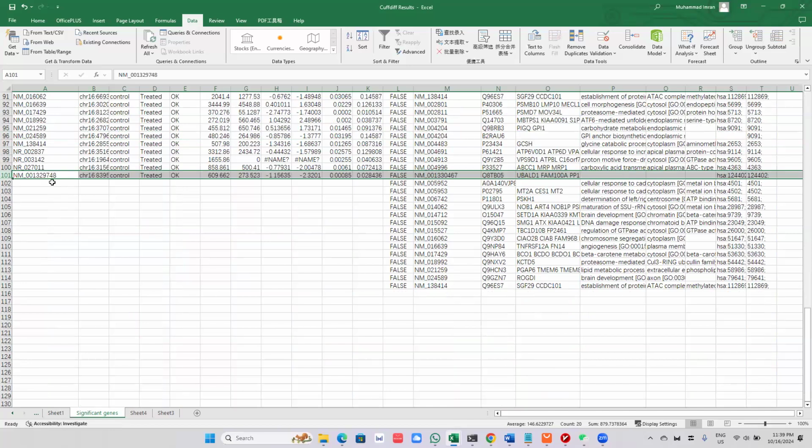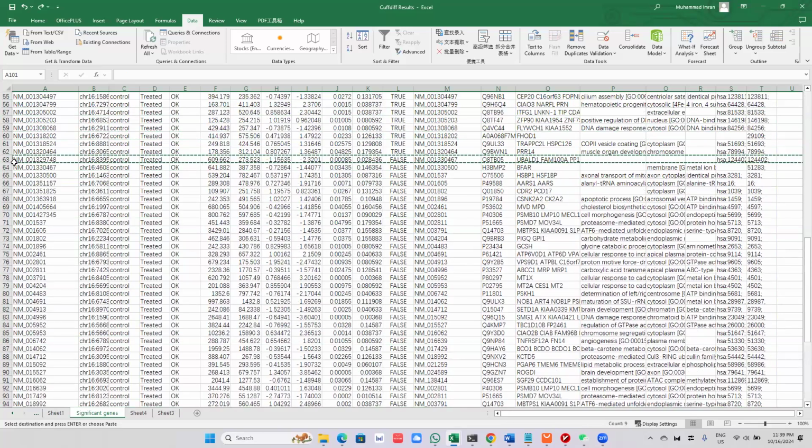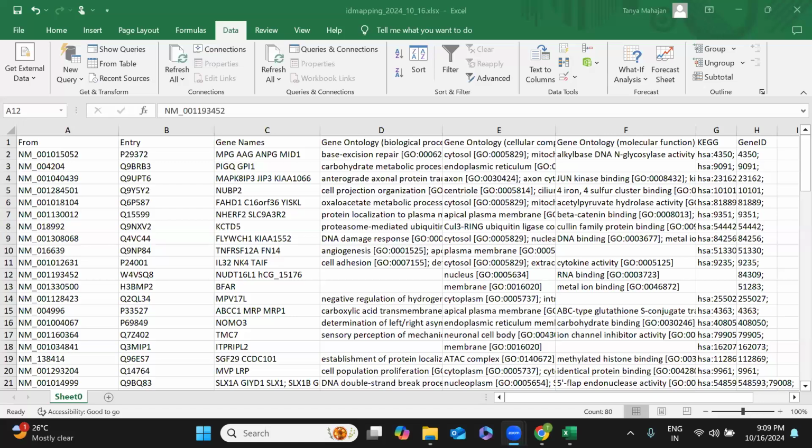What you did? No, you don't have to cut it like entire. Shall we do it on my system? Otherwise you won't be able to follow. Yes, ma'am. Thank you. Wherever you guys are getting stuck, just pause me, okay? In between.